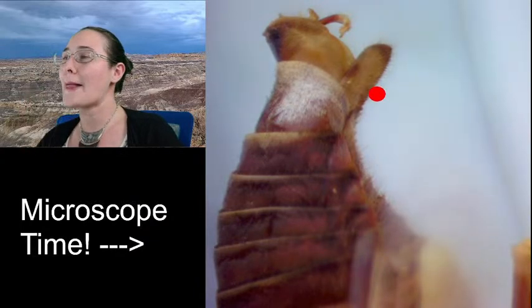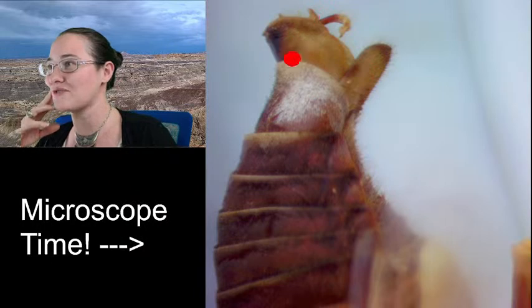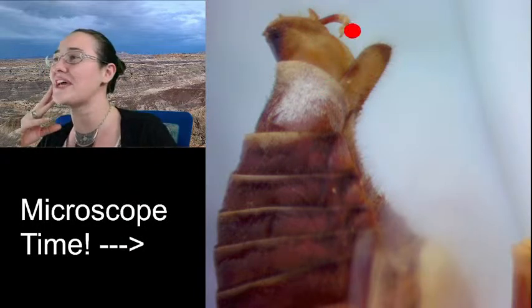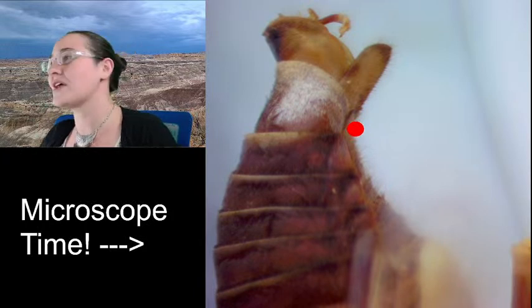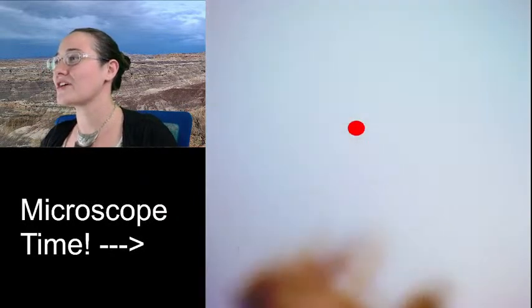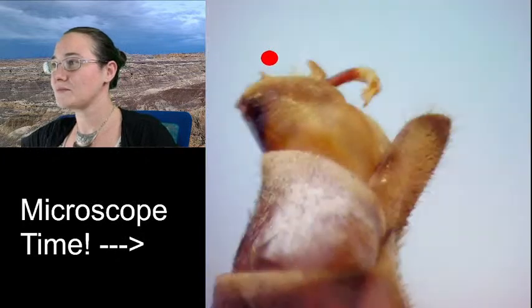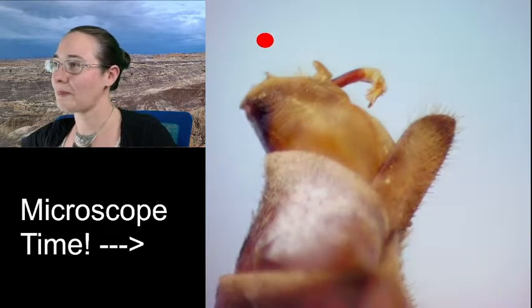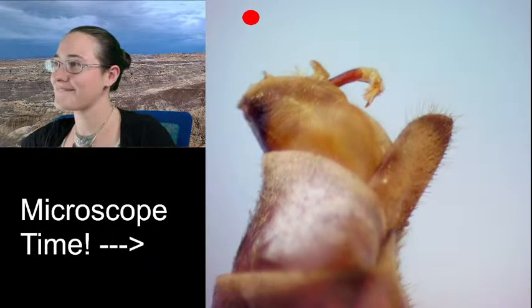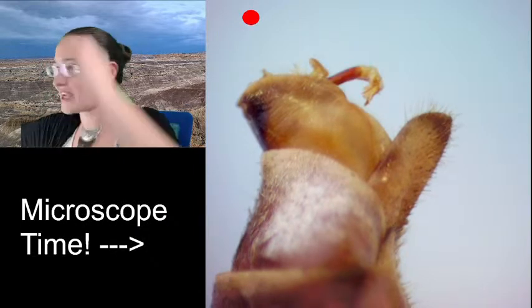But this is not a female. This is a male. One of his reproductive organs a lot of times is closed into his abdomen, but this specimen has them all kind of sticking out. So it's fair game, we can look. He's got this crazy hook. Yeah, so that's one really cool feature of this cicada.